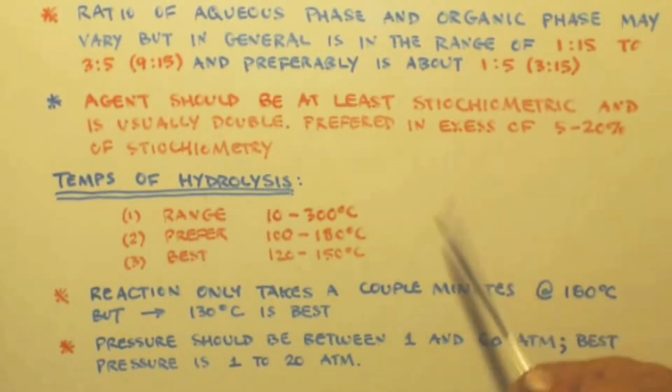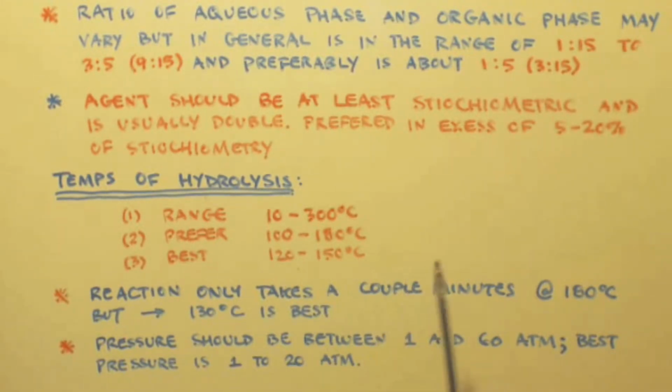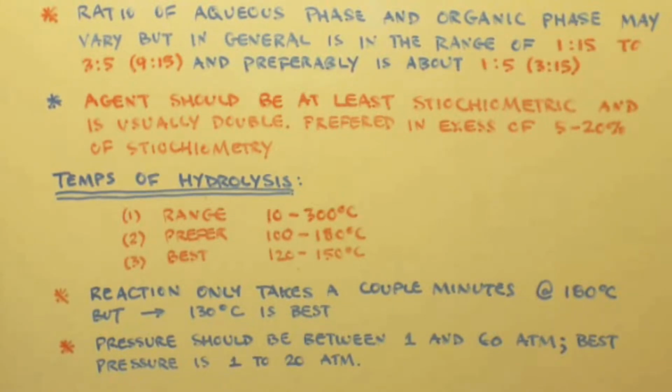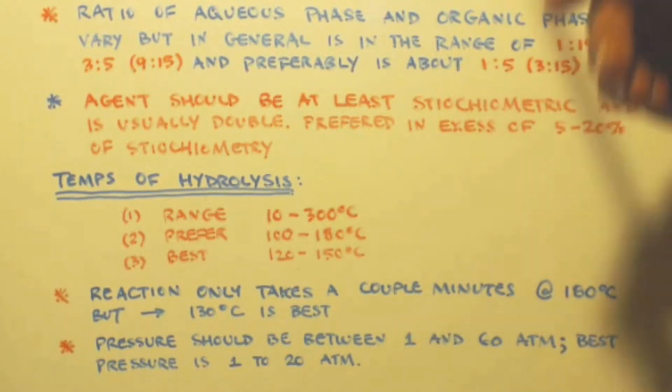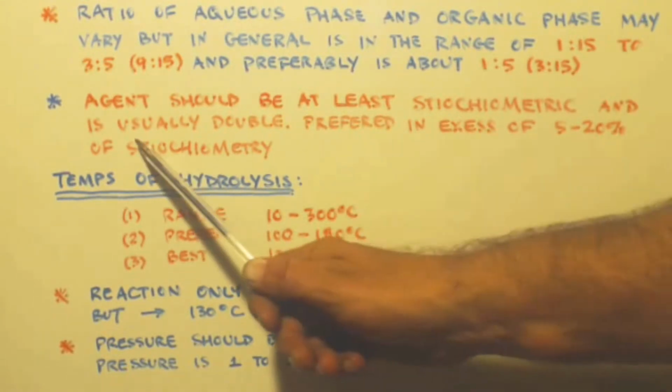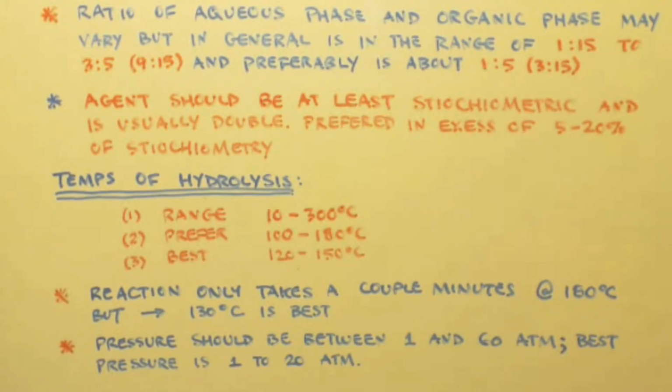Okay, now the agent should be at least stoichiometric. So if you have a mole of chlorine you need to get off of the toluene, then you'd need a mole of hydrolyzing agent. Keep in mind, if you're doing the benzal dichloride derivative, then you need twice as much hydrolyzing agent. Just like if you're doing the benzyl trichloride, you'll need 3 moles of hydrolyzing agent to be stoichiometric. It usually is double. Usually you put double the amount that you need stoichiometrically, okay?